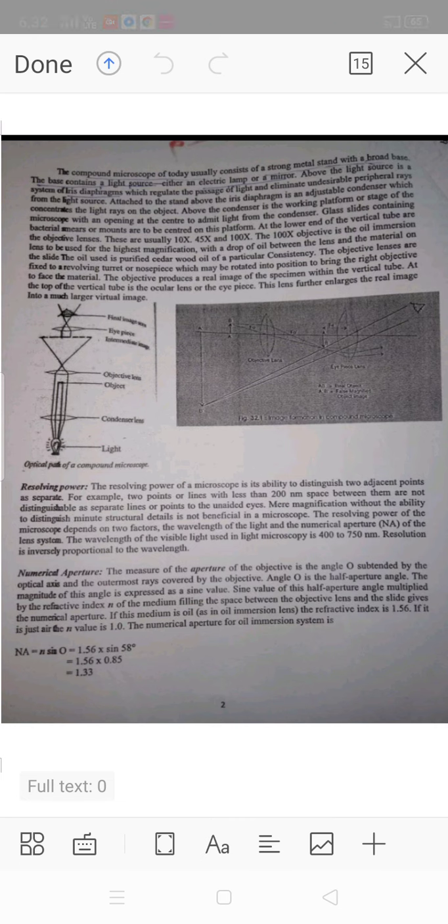The structural components of a compound microscope. The three basic structural components of a compound microscope are head, base and arm. The head or body is the optical part in the upper part of the microscope. The base of the microscope supports the microscope and the illuminator. The arm connects to the base and supports the microscope head. It is also used to carry the microscope.